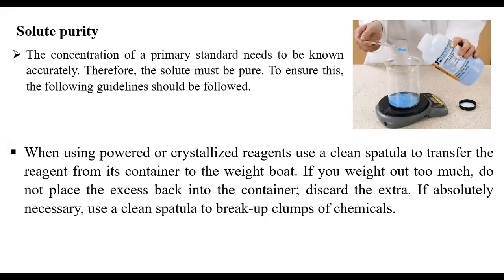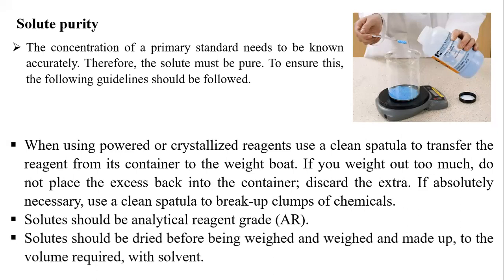Coming to the next point, the solute should be an analytical reagent. It should be AR grade only. We should use only AR grade for preparing any primary standard. Solutes should be dried before being weighed and made up to the volume required with the solvent. So we have to take the exact amount of solute and put the same amount in the required volume of solvent. So in one point, students, a primary standard is nothing but a solution of known exact quantity or concentration.